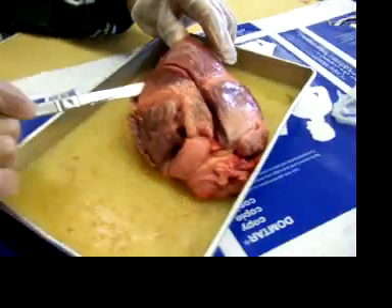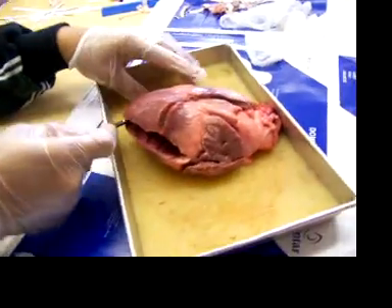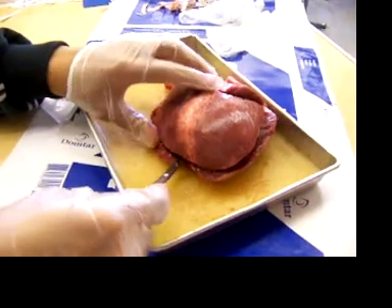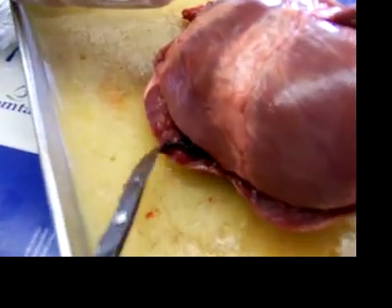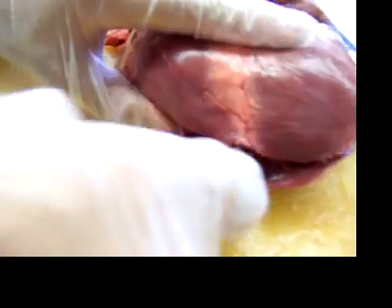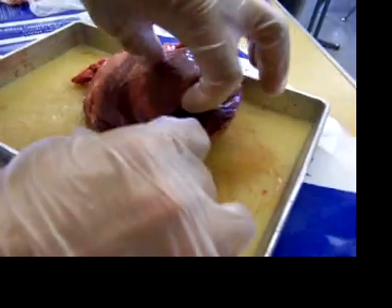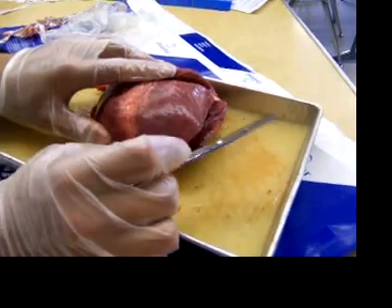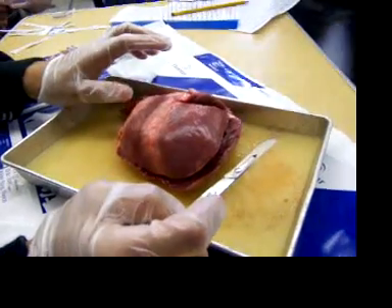That's the nice footage. It's congealed blood. It's like jello. So we're gonna — can you help us cut this open?